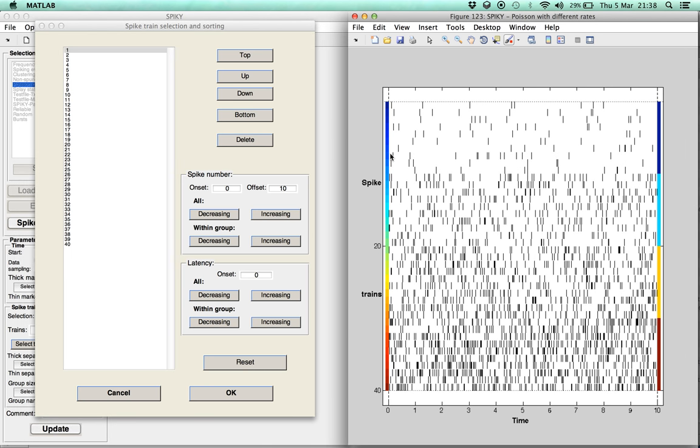Now, in the second part, we show how to use predefined criteria to sort the spike trains automatically. Currently, we offer two different criteria, both motivated from analysis of neuronal coding: spike number and latency.